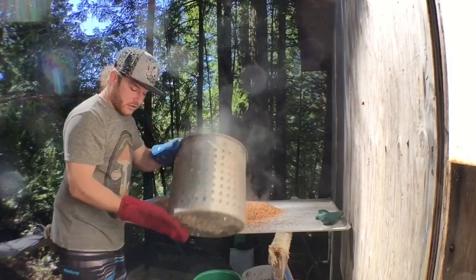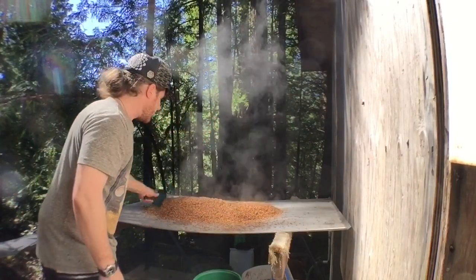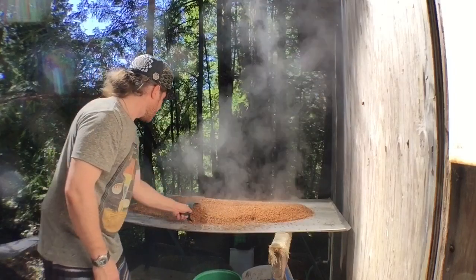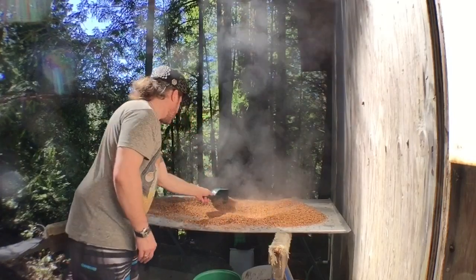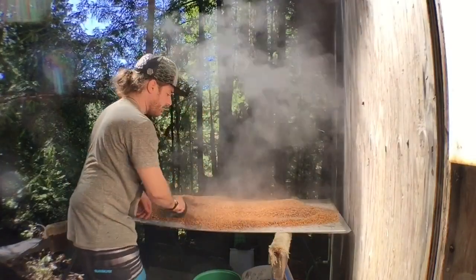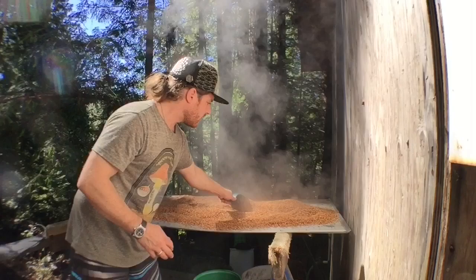So what we're going to do is, once we have them all laid out, we're just going to move them around, get as much surface area open to let off steam. We want all the surface moisture to wick off.